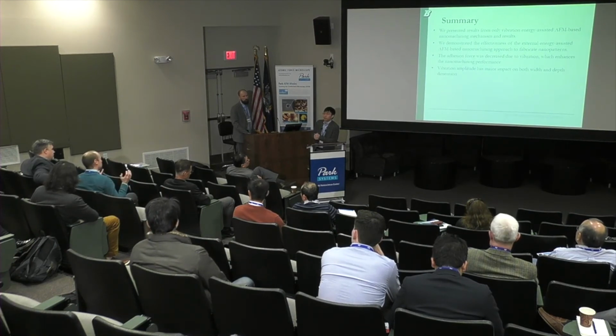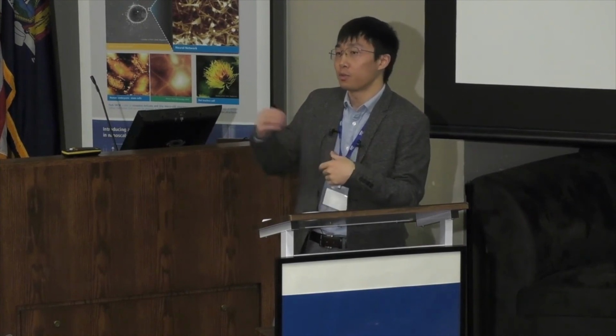Yeah, millions or billions. How long would that take? That will take forever, obviously, for the AFM. Even for photolithography and electron beam, they need a mask. So this is a technique for making a mask, as an electron beam is usually used for making a mask. Another way to mass produce is using the molding process.